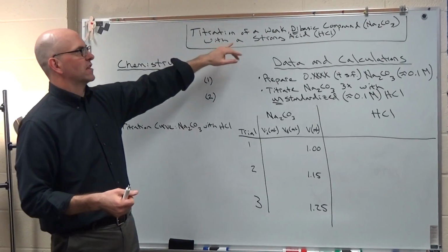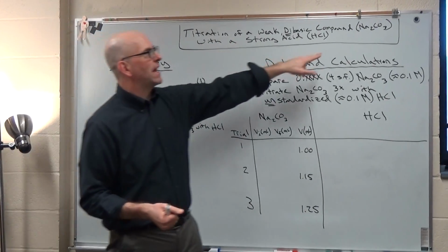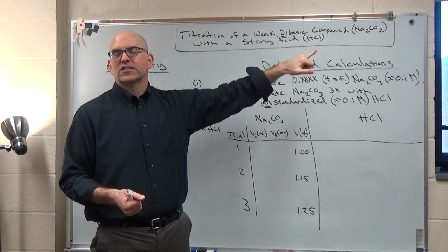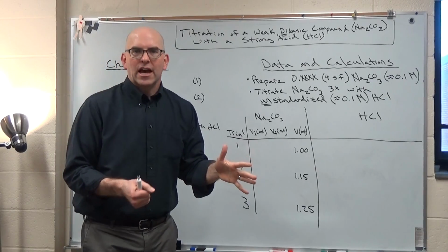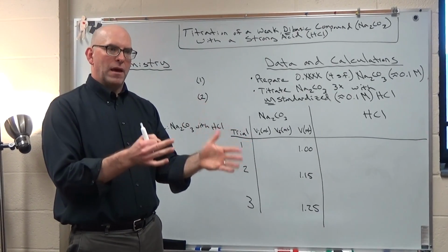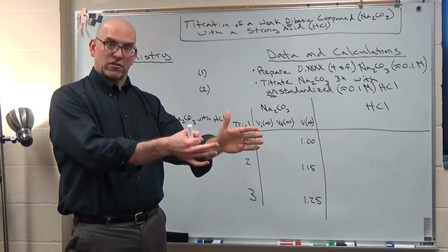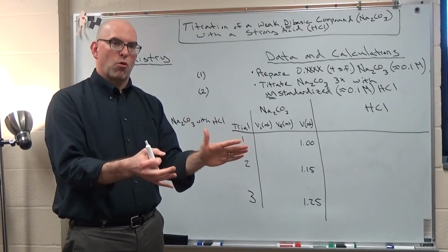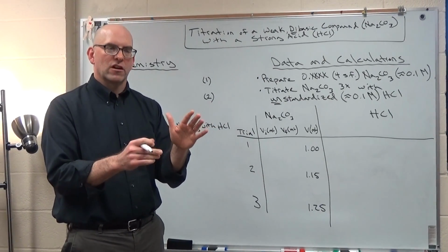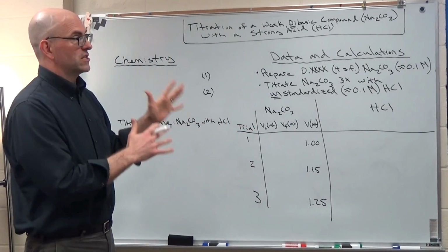So more specifically, what we're doing this week is we're titrating a weak dibasic compound, sodium carbonate, with strong acid, HCl. So that's what we're doing. And this is actually the first in a series of labs that we're doing, acid-base and equilibrium chemistry combined, and also a buffer lab down the line. This is all really important stuff for biology, for geoenvironmental studies and chemistry. So these are really good labs. They're pretty complex. So all this is a supplement to the pre-lab.